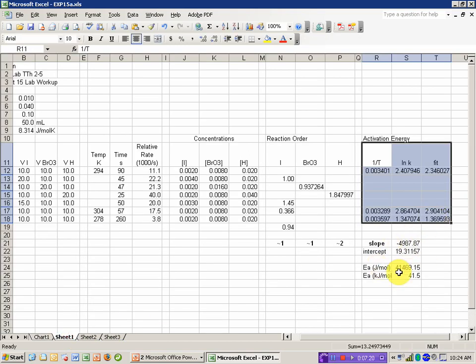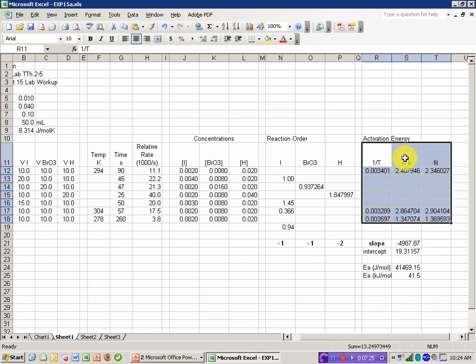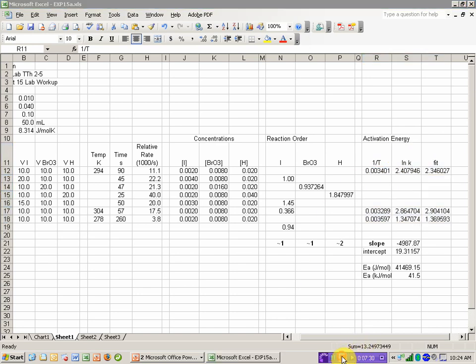And that's my Arrhenius plot right there. I've done the calculations using that independently in Excel. But the plot itself is that graphical representation of the natural log of the rate data versus the inverse temperature.